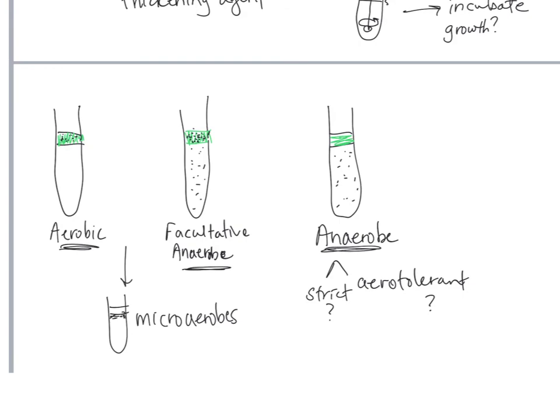So again, just make sure you pay attention to what organism you're supposed to be inoculating. You might use a different organism for each of the three parts of this experiment.